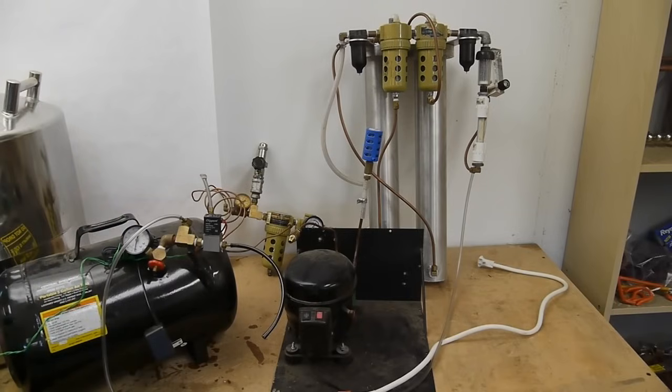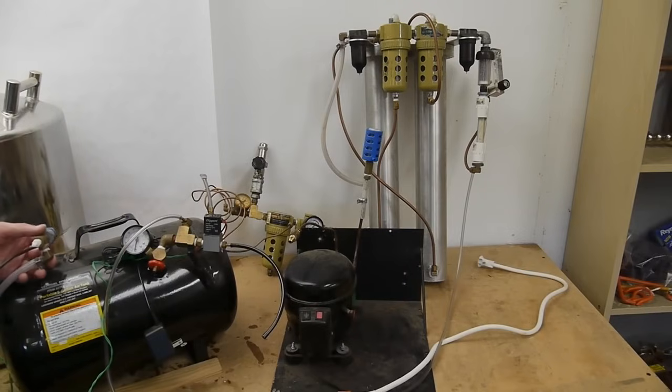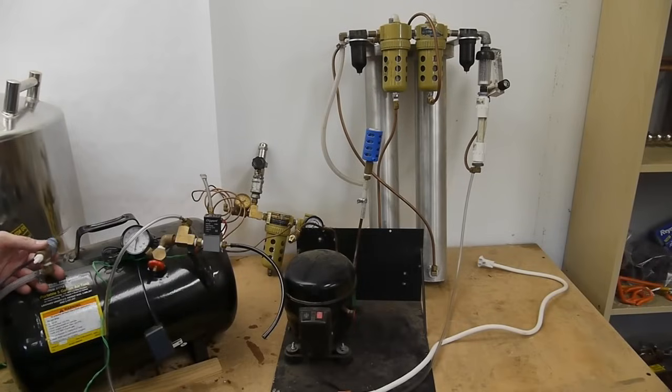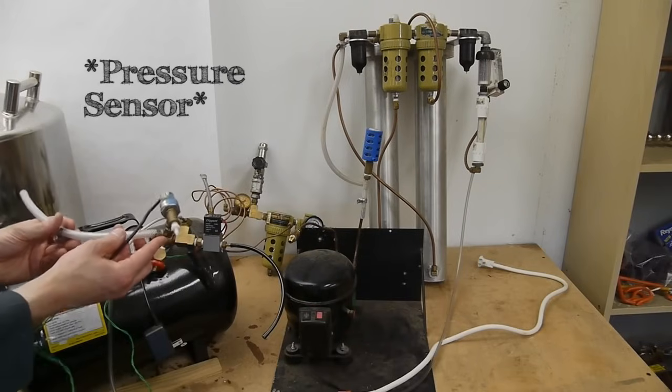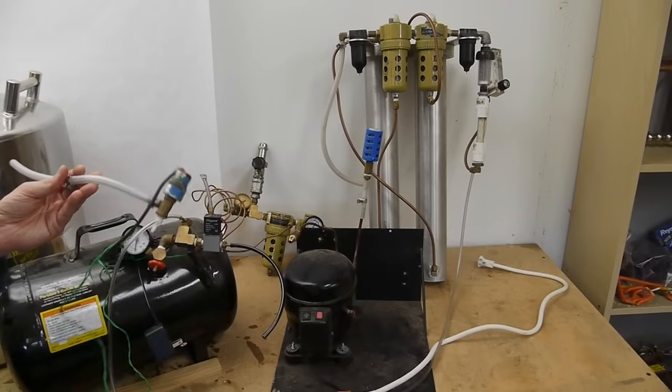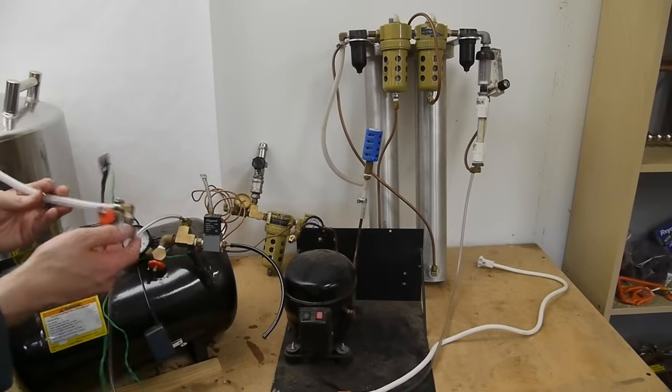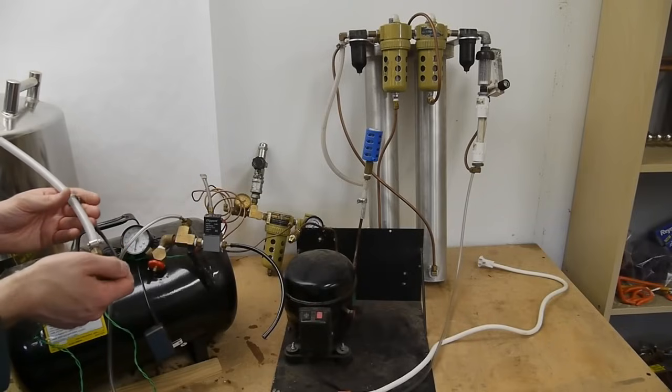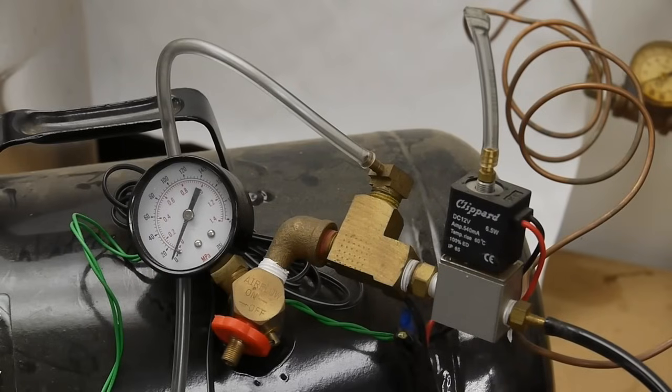The vessel in which the liquid nitrogen is being created, you know the nitrogen is being condensed into a liquid, you want there to be a slight positive pressure of nitrogen gas in there so if there's a slight leak it doesn't pull in atmospheric air. It's controlled by a pressure valve and this is set to something very low like maybe half a psi above atmospheric and this is connected to the vessel in which the liquefaction is happening and then there's a valve here that adds nitrogen gas to the tank.